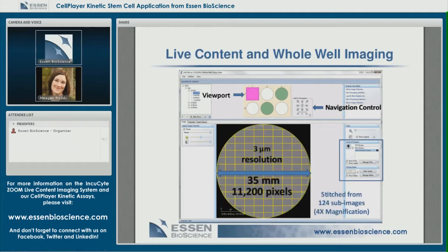We retain our three-micron resolution. This is one well of a six-well plate, which has a 35-millimeter diameter. The whole well image from this well is created from 124 sub-images at 4X magnification.